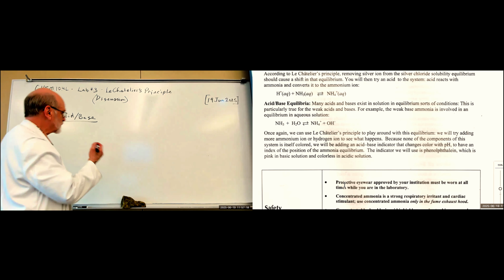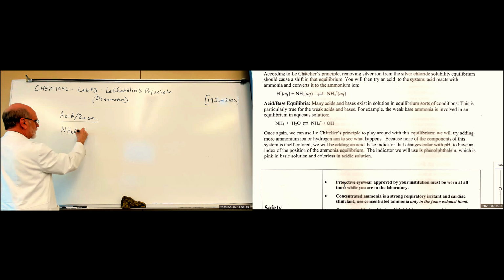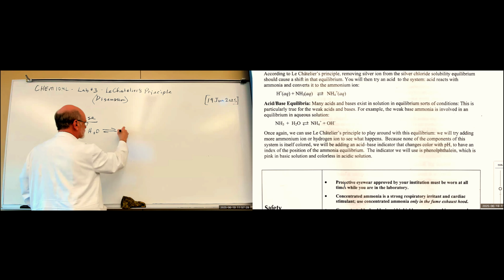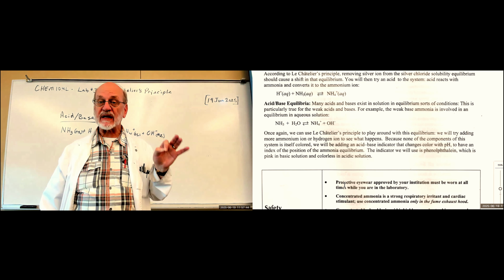All right, so once we have this equilibrium established, this is a weak base reacting with water to produce ammonium ions plus hydroxyls. So the solution should be basic, and if we drop some phenolphthalein in there, it should turn pink.